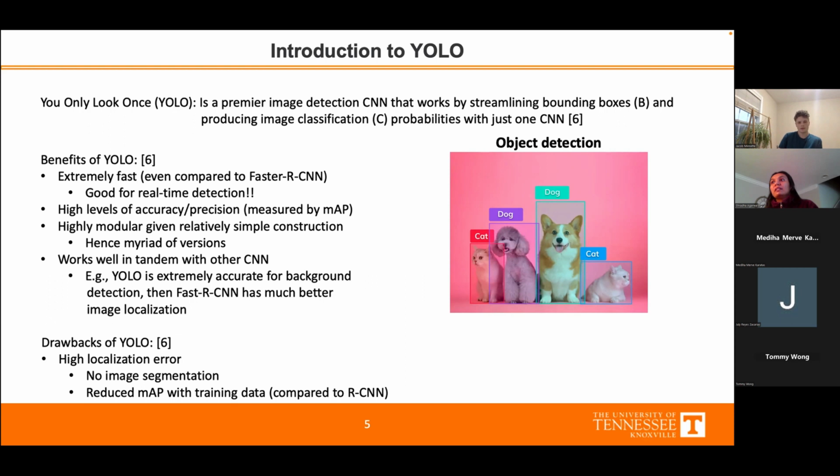So in this way, your model is trained faster because it already has predefined boxes of that shape. So it doesn't have to look for a grid and everything. It just optimizes the final predictions based on that. So this is in both YOLO V5 and V6.